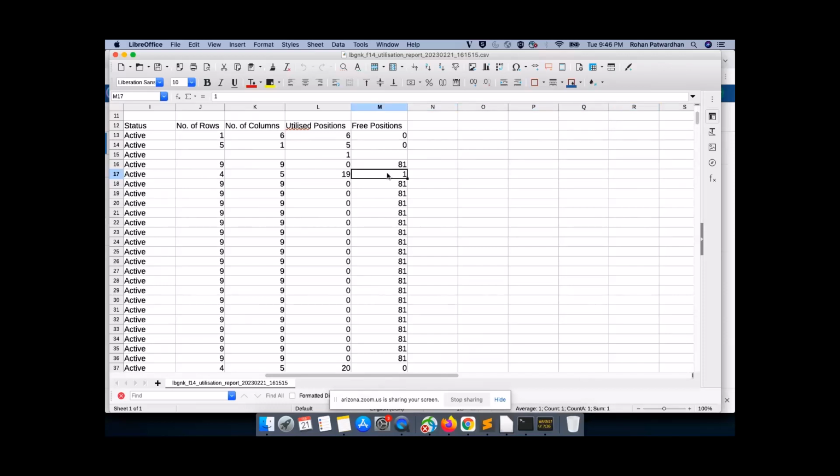So you still have an option to place one box within the available box. These many positions are available. So if you do a bit of math, you will be able to get a better idea at what frequency and at what time you need to add more boxes, and at which boxes you need to make space, and that kind of stuff.